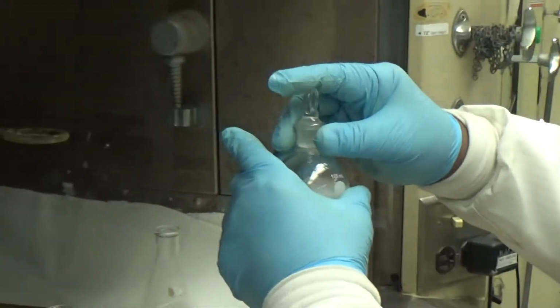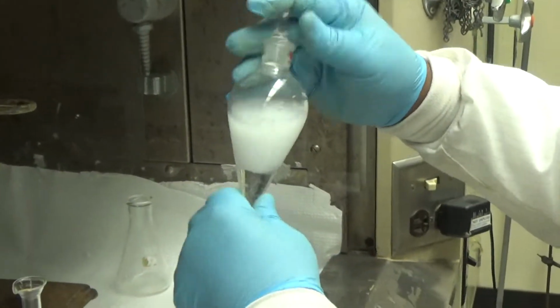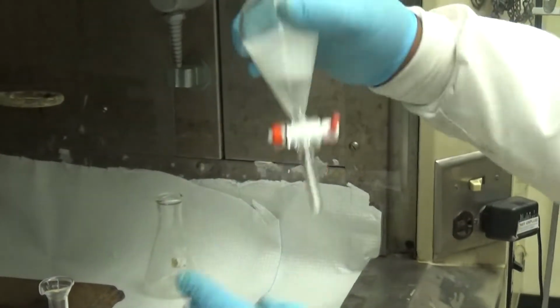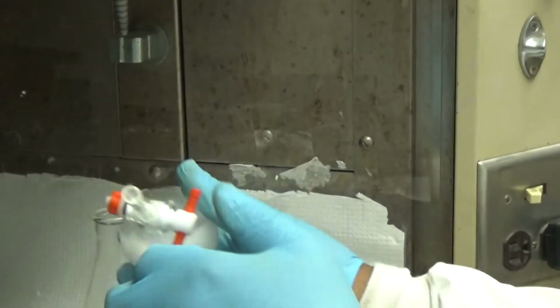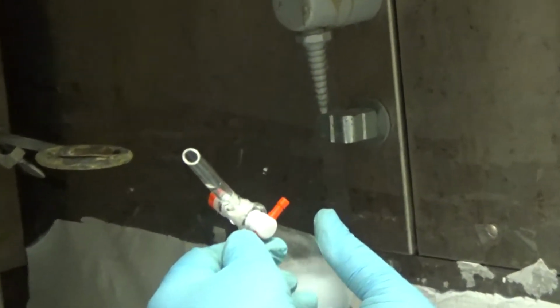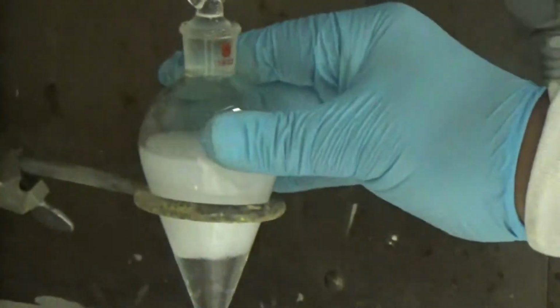And they know the density and that the methylene chloride's in the bottom, right? Like that. When you do that, you also have the helmet. Get out of the way so it doesn't shoot at me. I'm not going to do that. Put that back here. Okay?